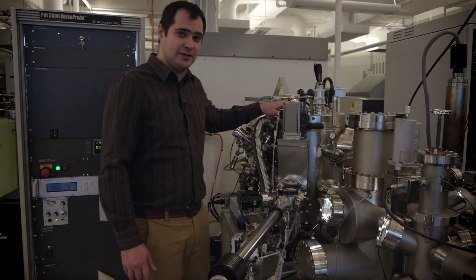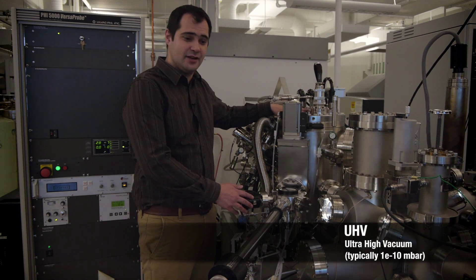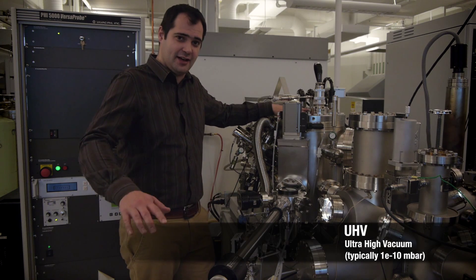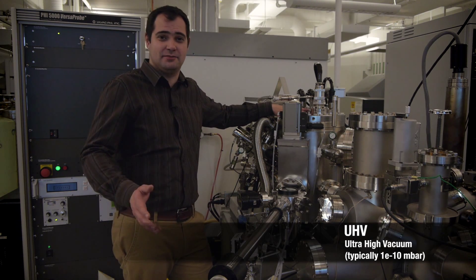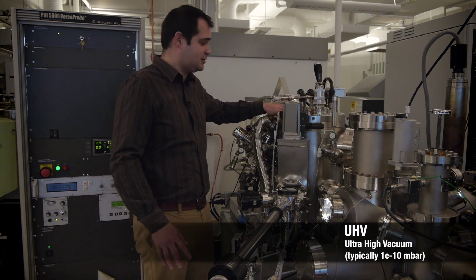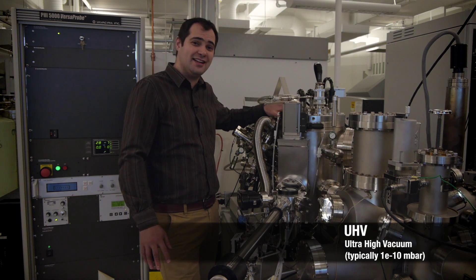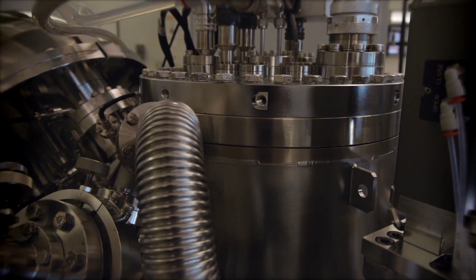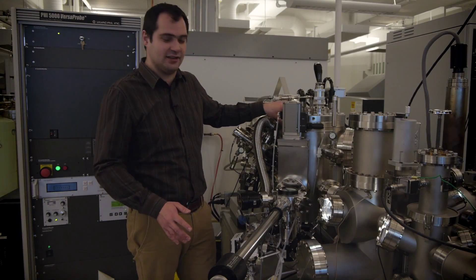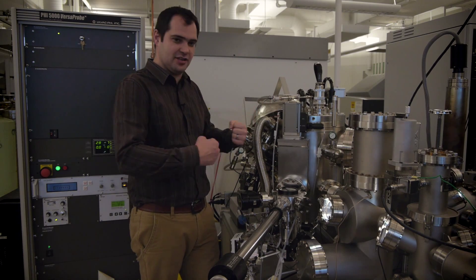We are doing our measurements in ultra-high vacuum. The pressure difference between here, which is atmosphere at say 1000 millibar, and inside the chamber is in the region of 1 times 10 to the minus 10 millibar. This is why our chamber has these thick pieces of stainless steel — it is holding that pressure difference.